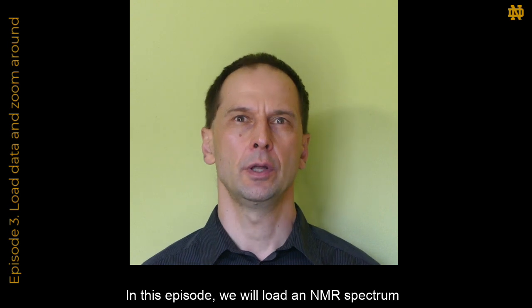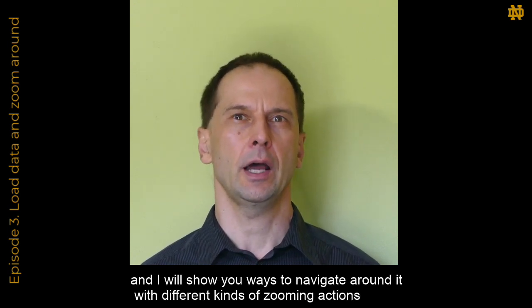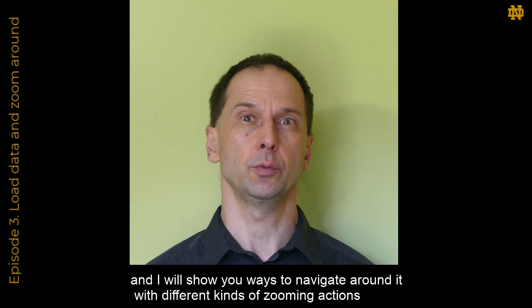In this episode, we will load an NMR spectrum, and I will show you different ways to navigate around it with zooming actions.